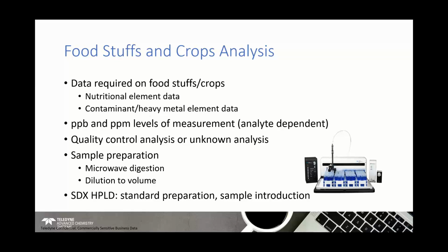So for foodstuffs and crops, typically, because you're working with a solid sample, you're going to need to do some form of digestion or breakdown on your sample to get it into a liquid state. And that's typically going to be undertaken with an acid-based media. And then you'll need to do a dilution to volume beyond that to reduce the concentration of the digest acid that you've used.